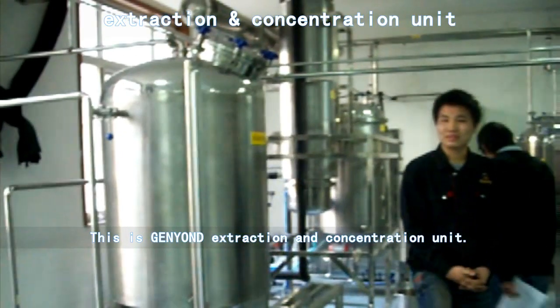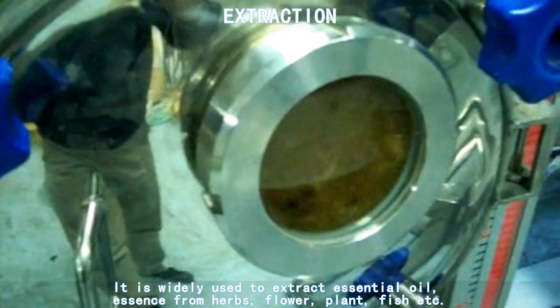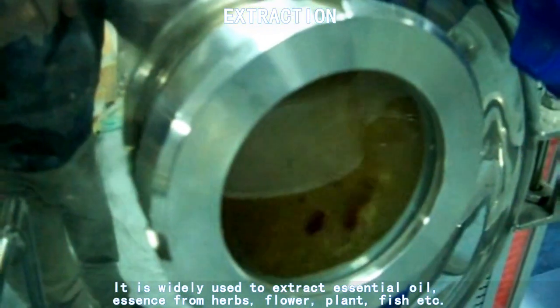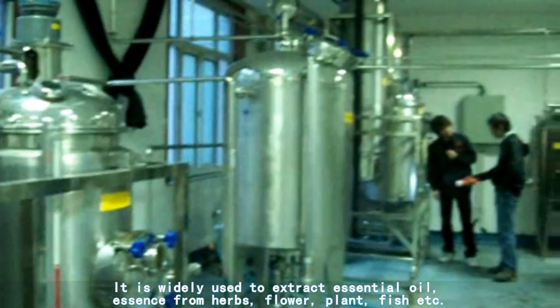This is GENYOND Extraction and Concentration Unit. It is widely used to extract essential oil, essence from herbs, flower, plant, fish, etc.